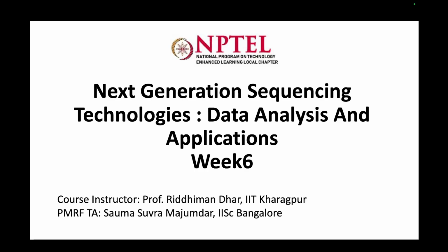Okay, now, welcome to week 6 of Next Generation Sequencing and Technologies, Data Analysis and Applications. So, this week we'll be mainly talking about variant calling. What are the different types of variants and what are the different algorithms and softwares used for variant calling? And we'll also see the format in which the variants are stored, whether it is a VCF format, how it looks like, and what are the different caveats for it.